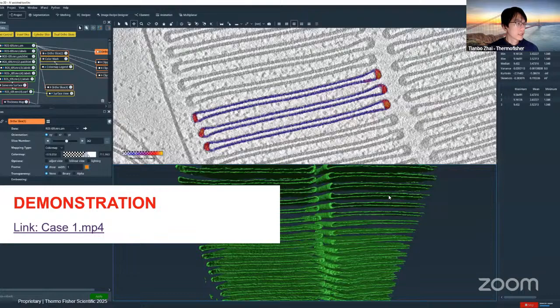And another case that we had briefly mentioned, I'll first explain the screenshot that you're currently seeing. So as we're trying to segment a membrane using the AI assisted tool, that was recorded in a previous version where we were using the so-called patch concept.